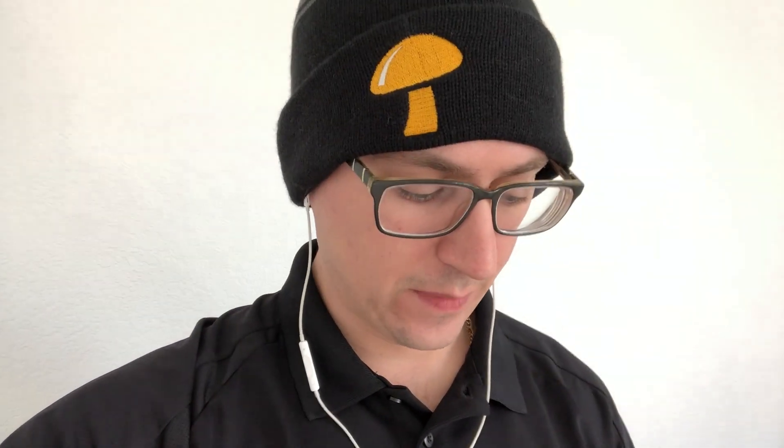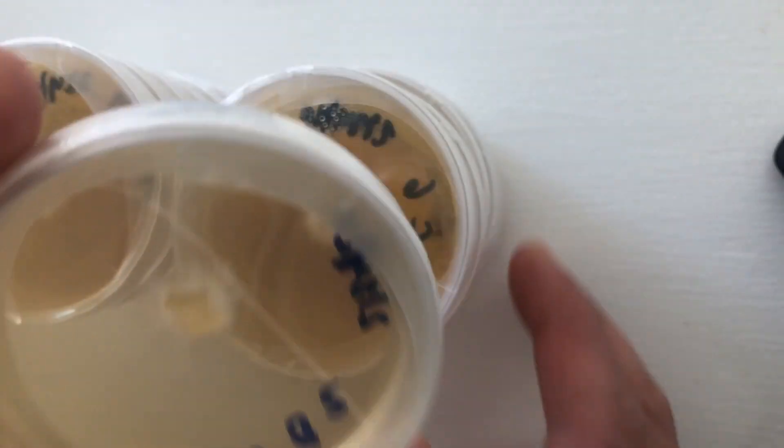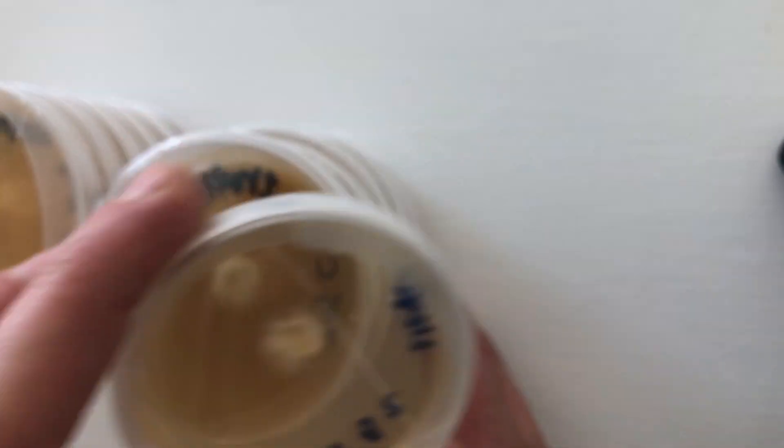I've also got lots of pink oysters, so I'll flip the camera and go through these isolates. Here are all of my pink oyster isolates — you can see the different traits in each one.